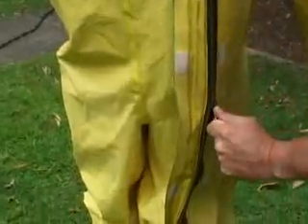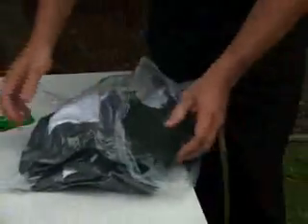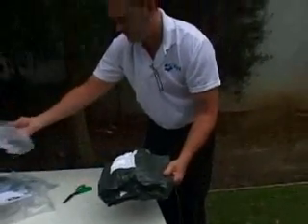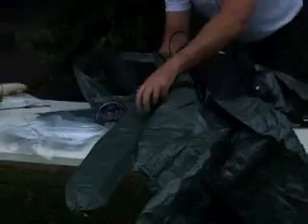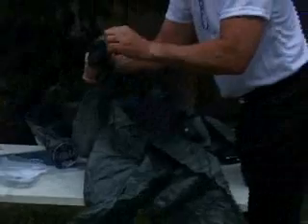And lastly, the SE400 fan supplied respirator is used again, together with a disposable SE Shield military suit made of Tyvek F material. This suit too is inflated by the fan unit, creating a positive pressure inside the suit.